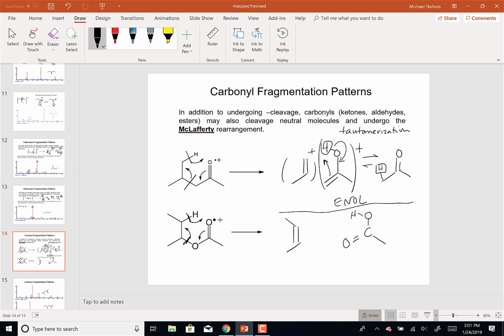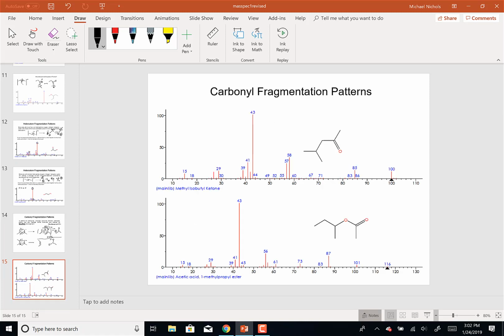So what they do is what's called tandem mass spectrometry. In tandem mass spectrometry, I can choose an ion. Let's say here's a random mass spec, and I want to determine the structure of this 87. In most of these instruments, it's not really a sequential thing.